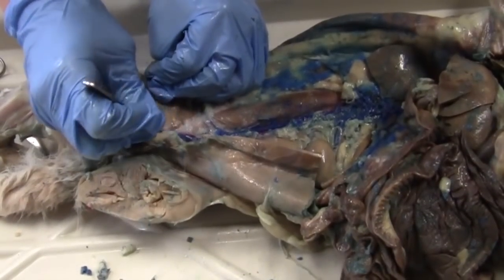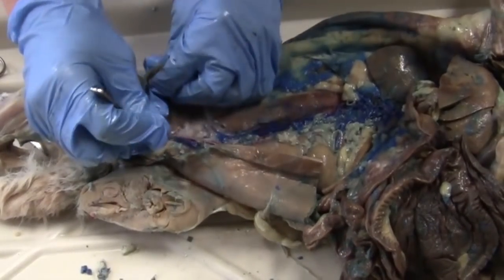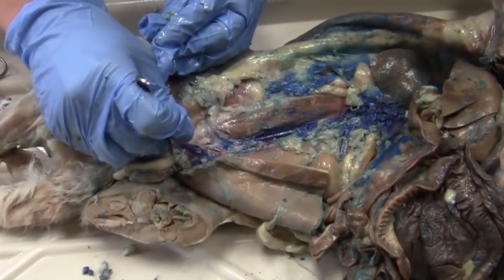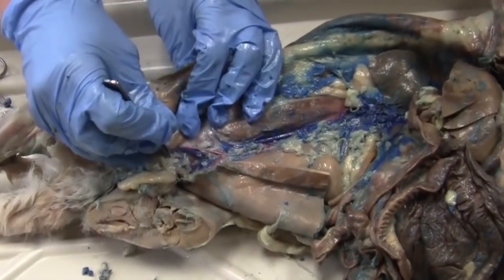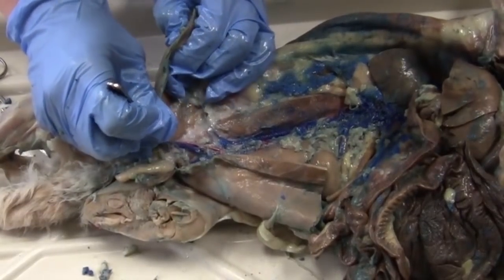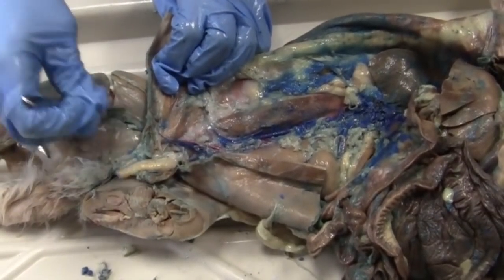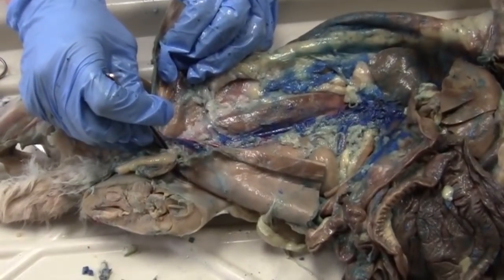I'm not sure if I'll be able to show you on the video, but the internal iliac is down here in the bottom of the, further down the vein just a little bit, and goes deep into the pelvis right here. It's probably hard to see on the video, so please ask me in class where this artery and vein is. But once again, just know that the external iliac goes externally, turns into the femoral, and the internal goes deep into the pelvis of the animal.